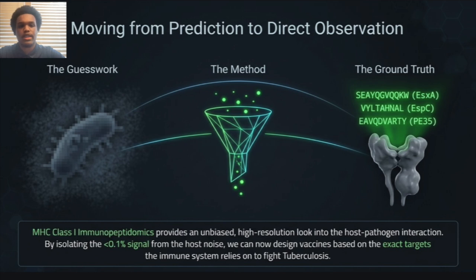Before we wrap up, consider this. Why is the W632 antibody the quote-unquote VIP of this experiment? I'll give you a few seconds to answer. All right. Without its specificity, the LC-MS/MS would be overwhelmed by the 99.9% of human peptides, and we would never find the bacterial sequences.